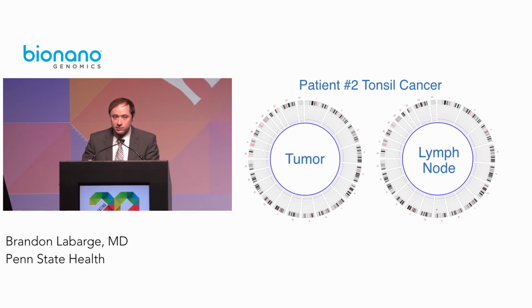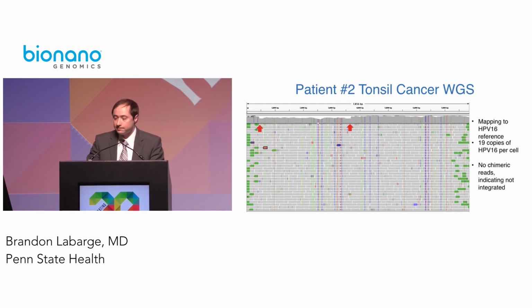The second patient is a tonsil cancer patient. On the Bionano, we can see that there's essentially no structural variance for either the tumor or the lymph node for this patient.